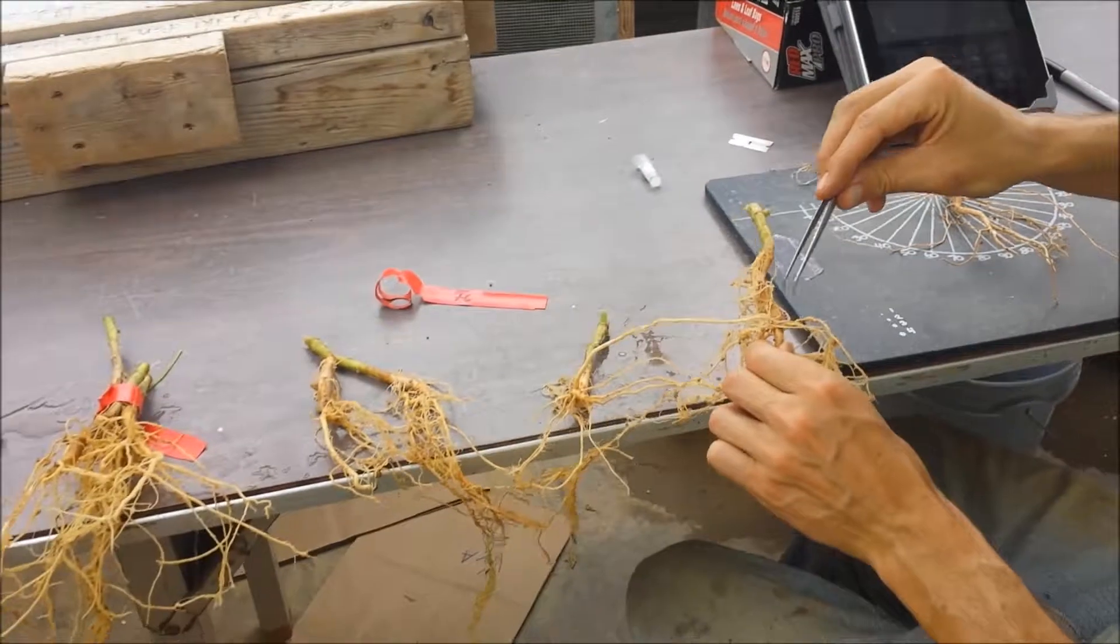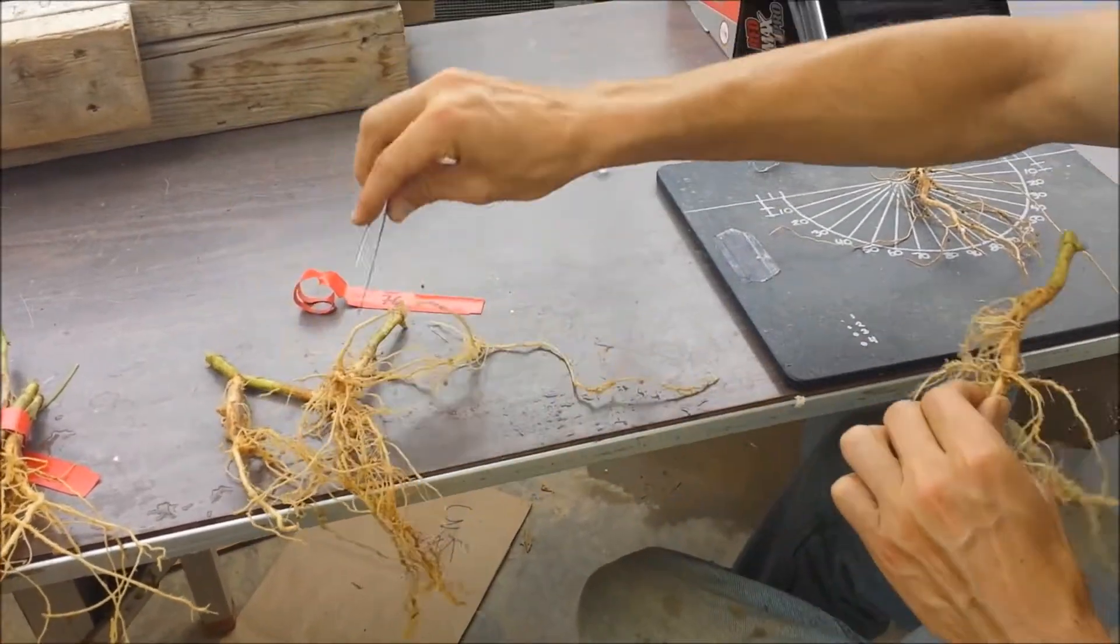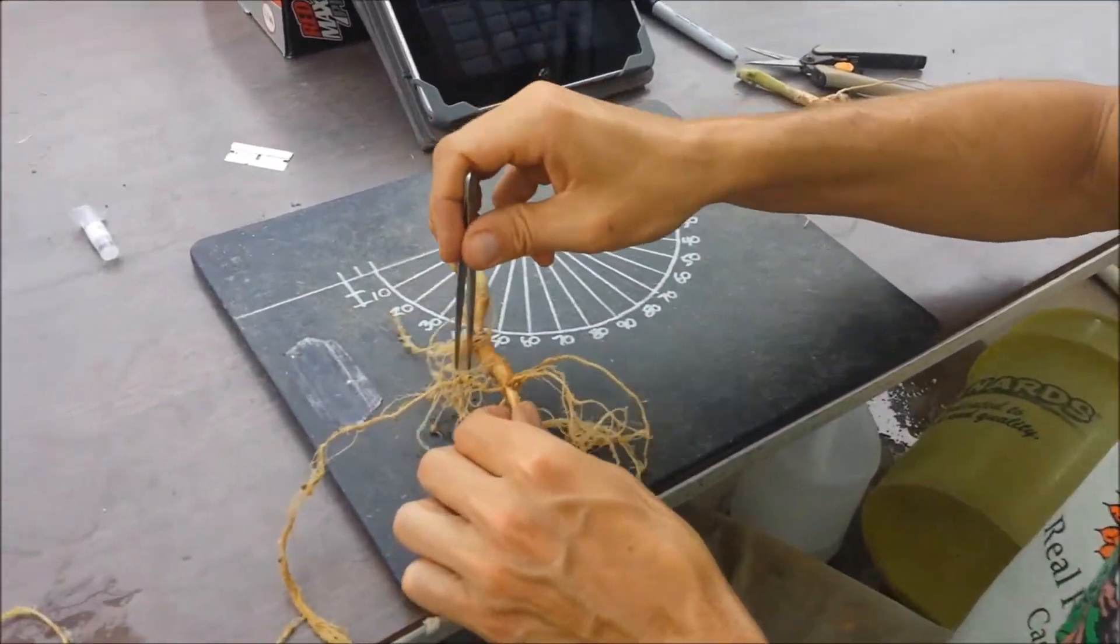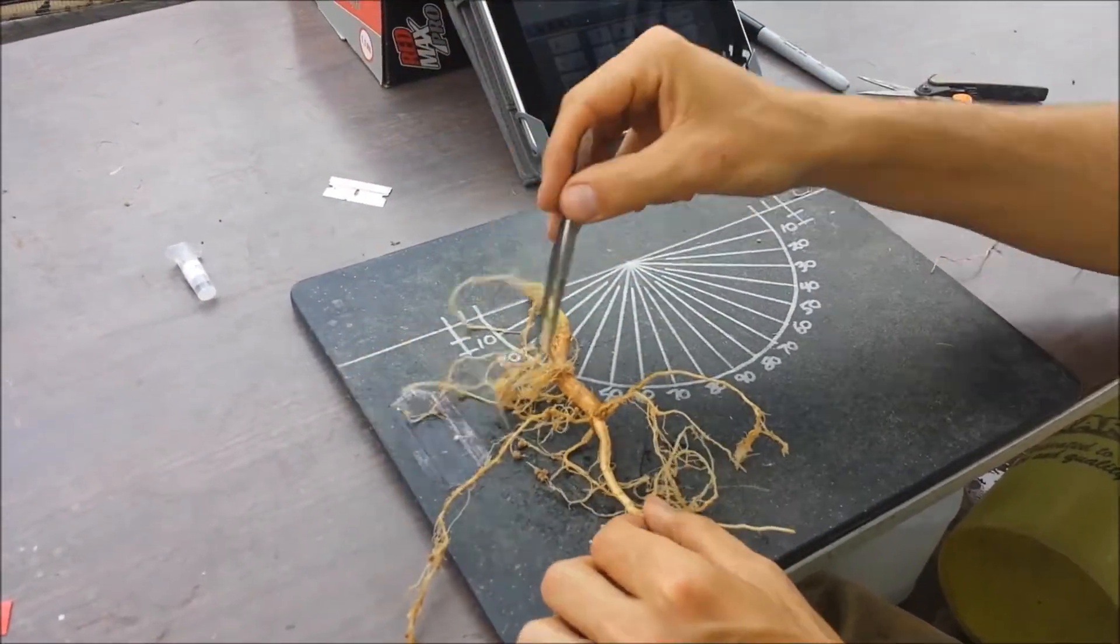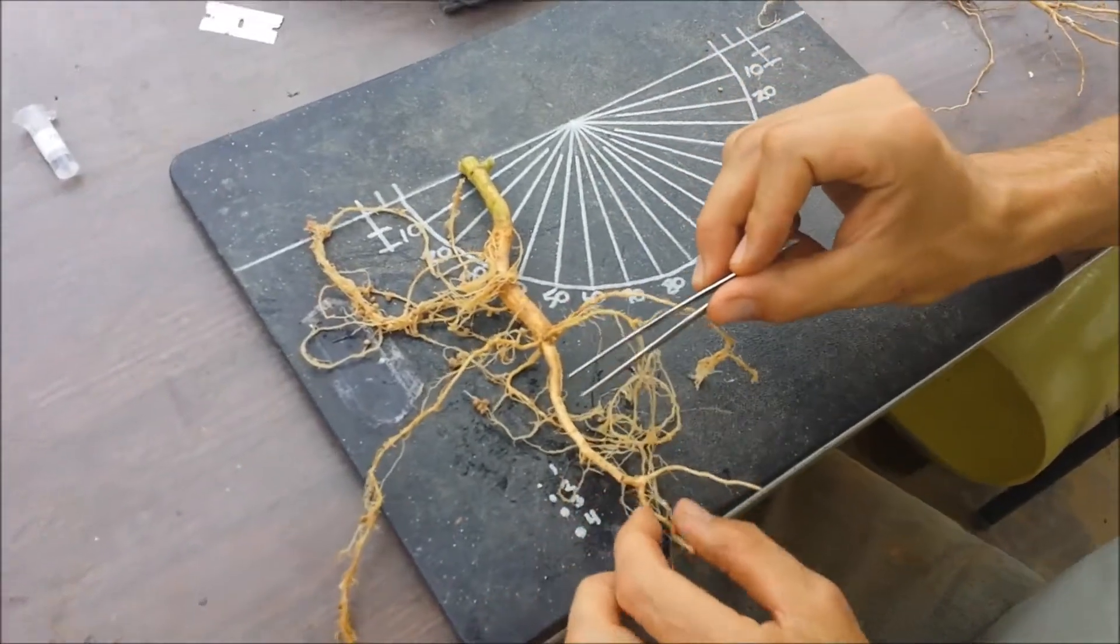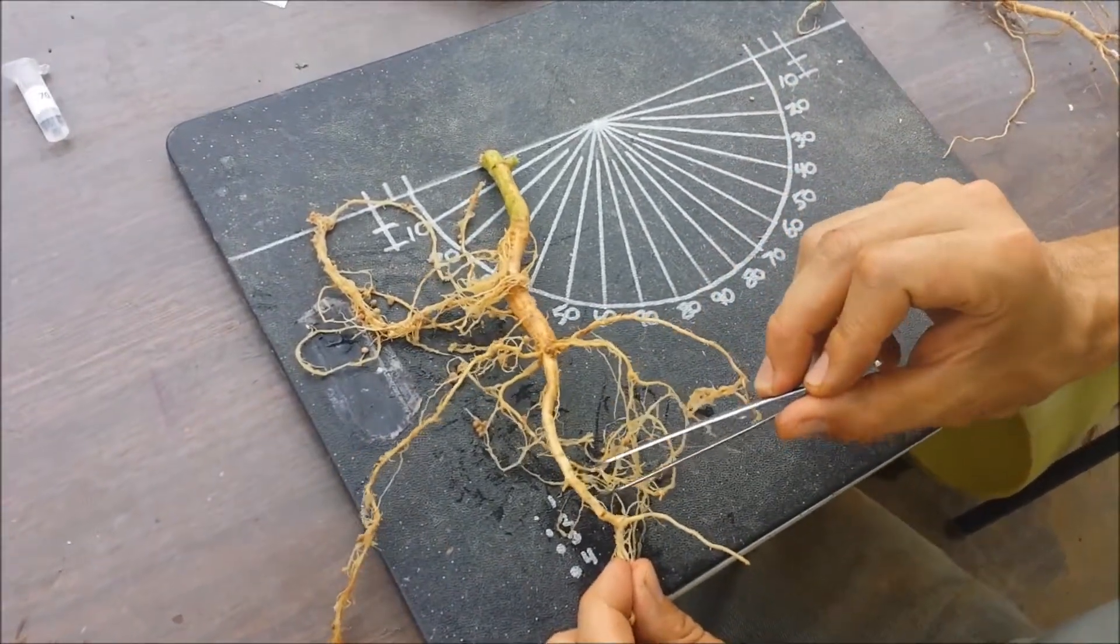If we wanted to look at this sample, we can see a much larger number of adventitious roots up here. The basal roots are right here, and the radical is continuing down this direction.